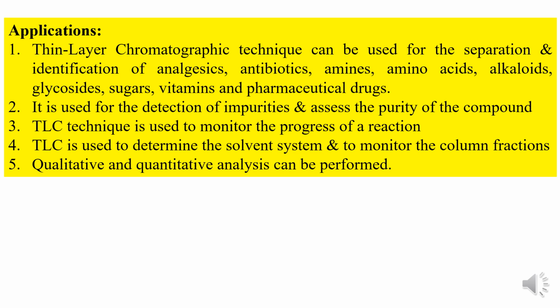Most importantly, the TLC technique is used to monitor the progress of a reaction. Both qualitative as well as quantitative analysis can be performed by this technique. And TLC is used to determine the solvent system and to monitor the column fractions.